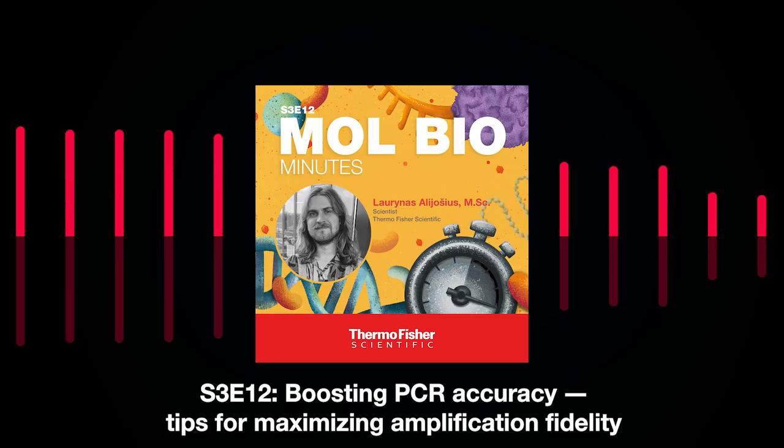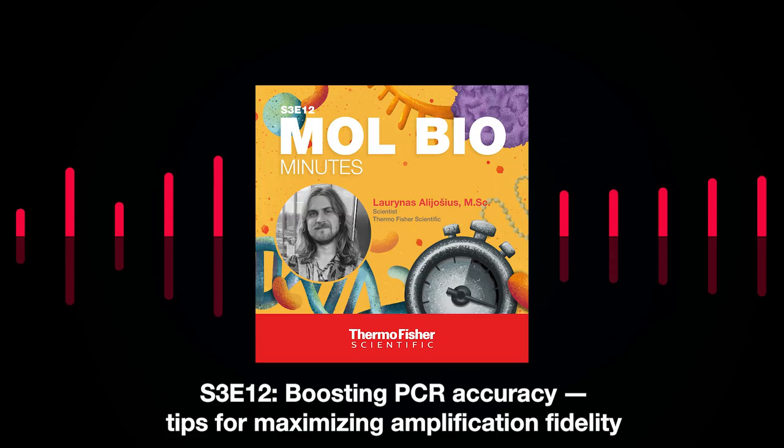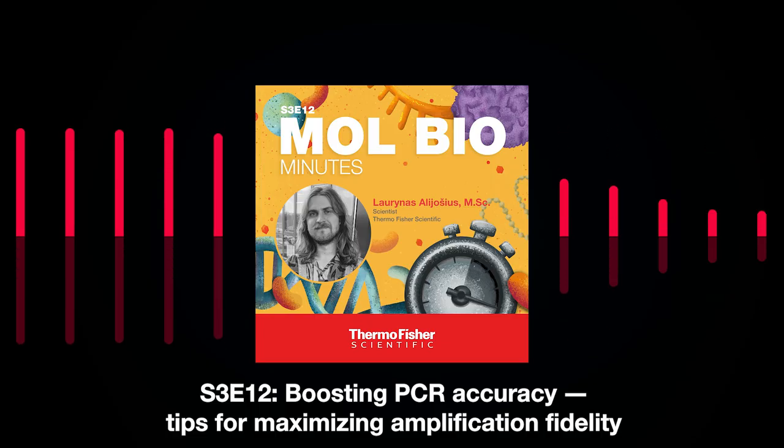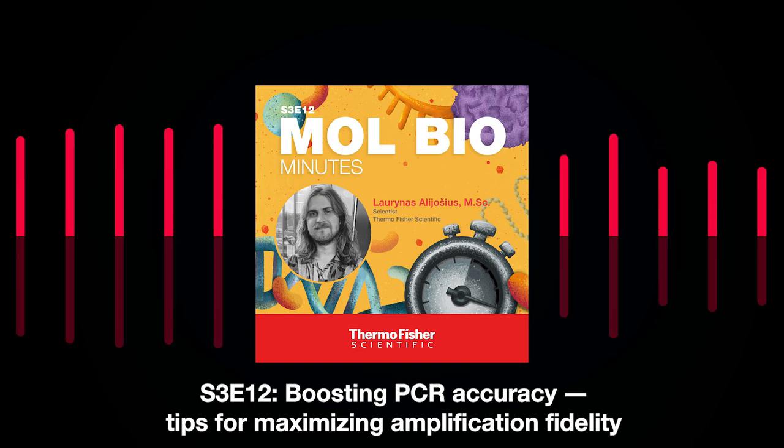If you want to learn more about these proper cycling conditions, you can find a link in the notes to a page that outlines PCR cycling tips to help you optimize it. So that's right about it for the starters of your accurate PCR journey.